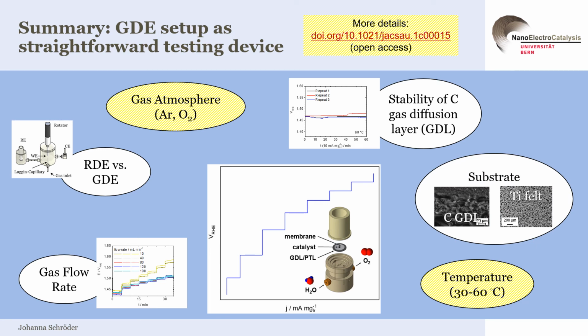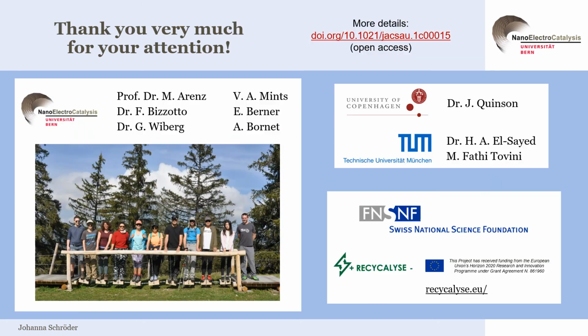I hope I could convince you that the gas diffusion electrode setup is a straightforward testing device for electrolyzer catalysts. If you're interested in more details, please check my recent publication in JACS Au.